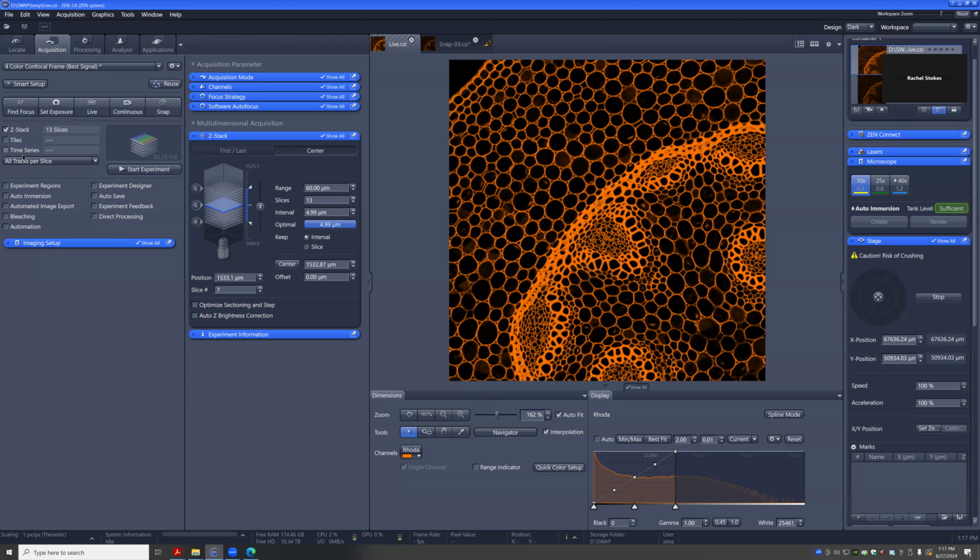Yeah. Or maybe the same 60, but lower. Okay, so same 60 and lower, that's straightforward. Like there, you just put different positions with a different center, right? Maybe we just go to the tile section so I can show what that looks like. So if I check that tiles box, you get this little menu right here. It says tiles, it says show viewer. We're just gonna hit that button right here.